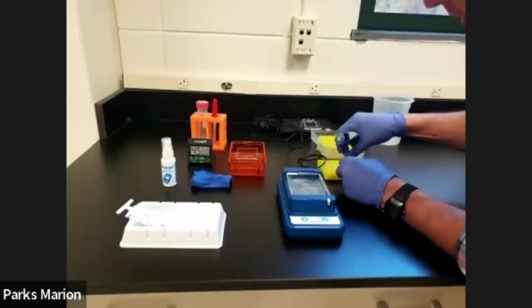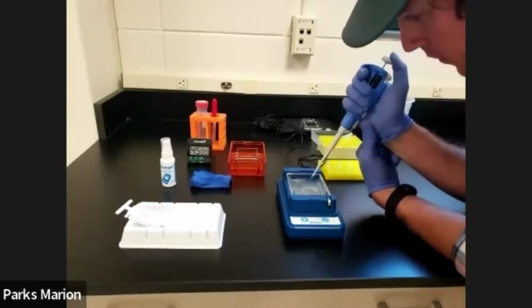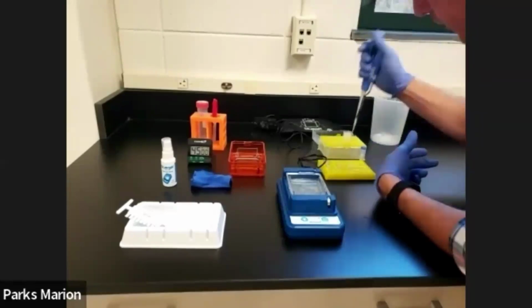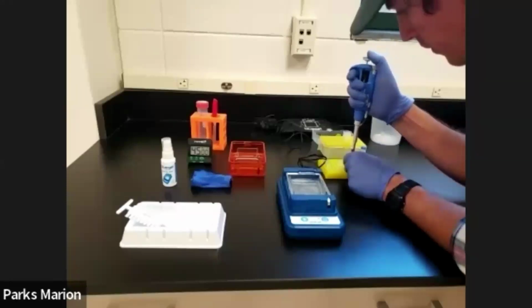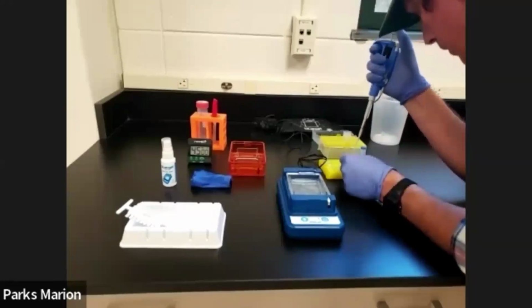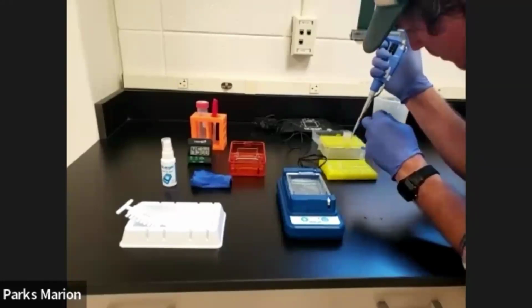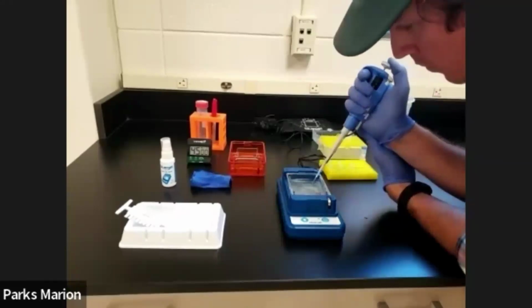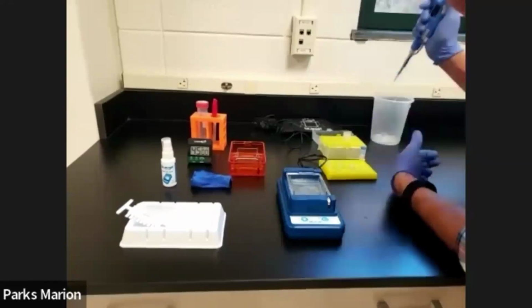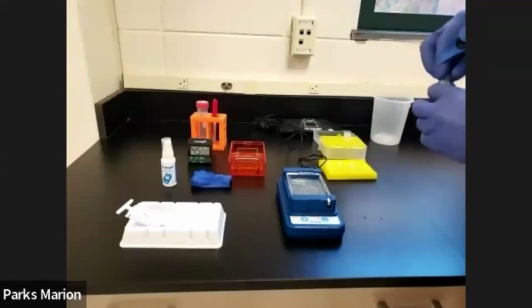Finally, we'll do 2 wells of our experimental sample. We want to then put 1 more well of our DNA ladder.